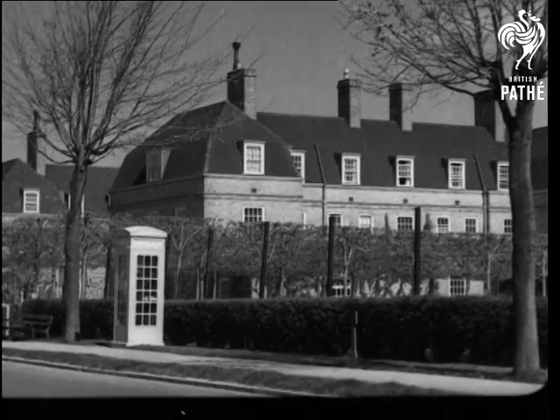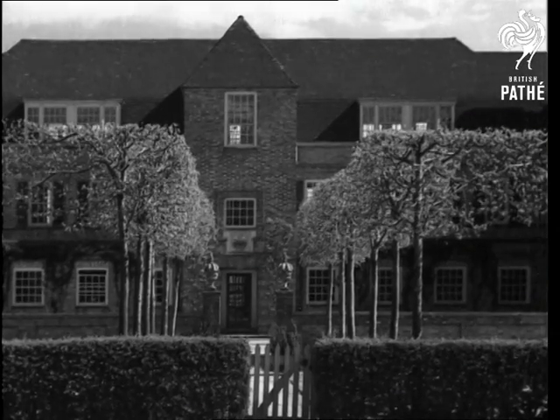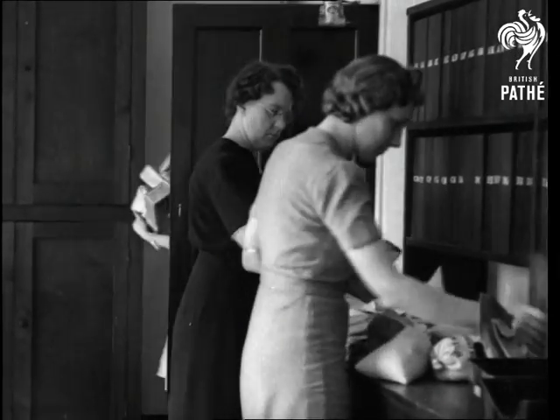Unlike those gentlemen, we'll run to seed — actually to the official seed testing station at Cambridge, where seeds for testing come from all parts of the country.